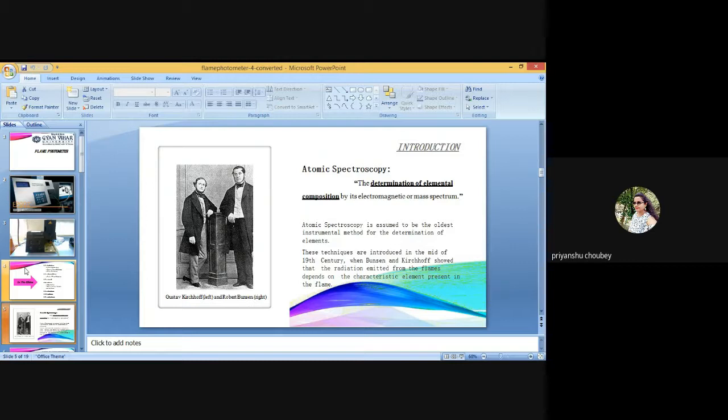Set the galvanometer to 100 with the highest concentration of standard solution. Repeat the last two steps until the above setting is obtained without further adjustment. Proceed with the determination of the remaining standards and sample. For switching off the instrument, close the gas supply first, run distilled water for about 2 minutes more, and then switch off the compressor. Turn off all the knobs and switches.